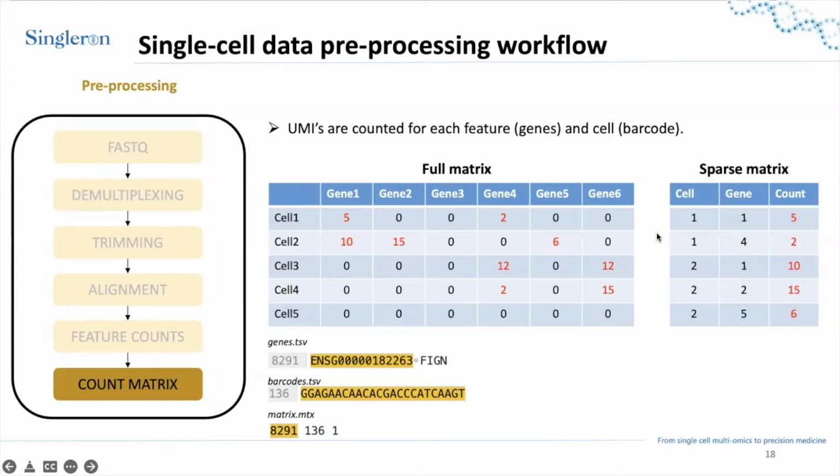And it is specifically useful because normally single cell experiments are quite sparse. You will typically have 30,000 plus genes, with a lot of them being 0 counts. Having a sparse matrix is helpful to reduce the size or the volume of the read counts, and easier for processing, and good for the computational calculations later if there is any follow-up analysis.